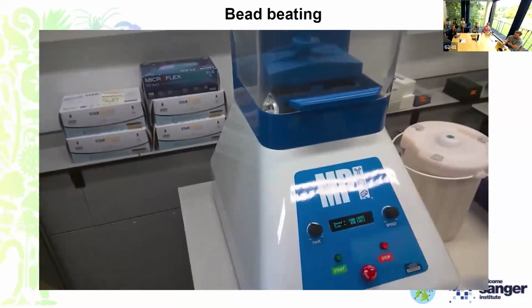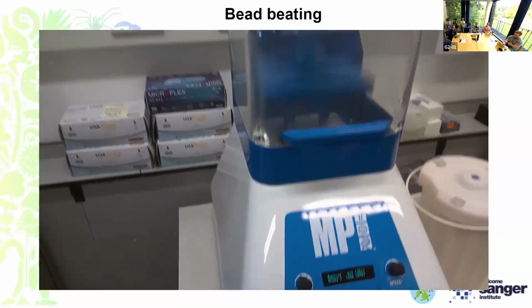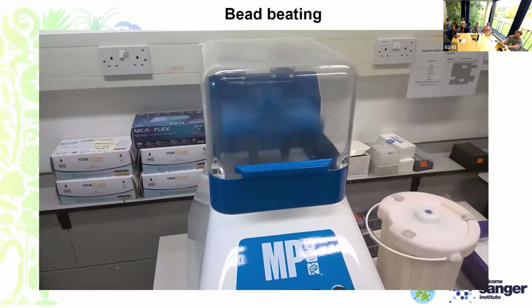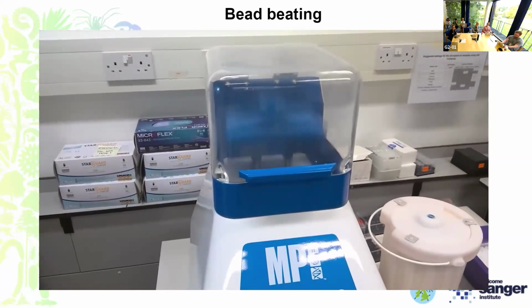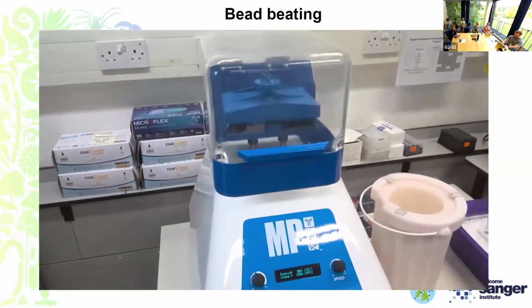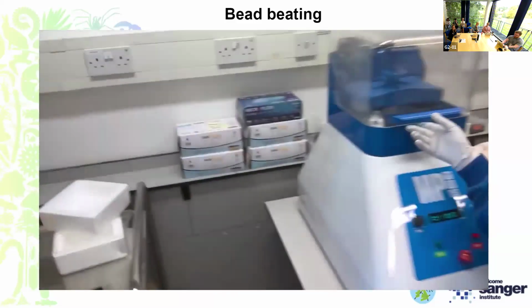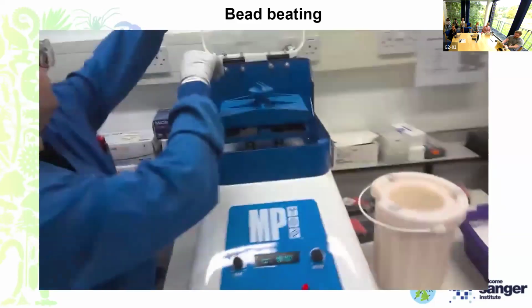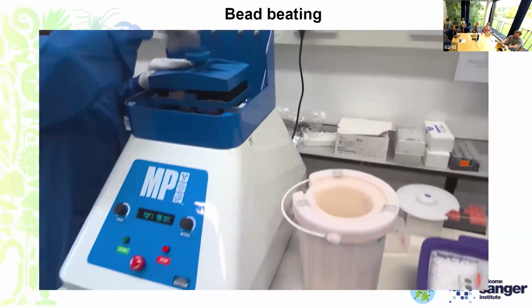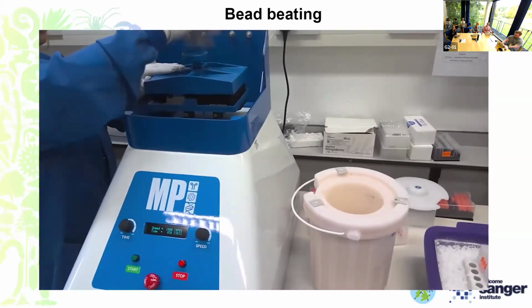Lid closed, and I now start the FastPrep at a speed of 1800, running for 30 seconds. This is done 3 times for corals and for plants. The reason we run for 30 seconds at a time is because the samples heat up during this process, and it's really important to cool them down again before each interval.